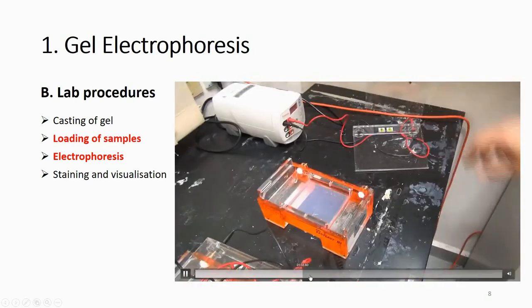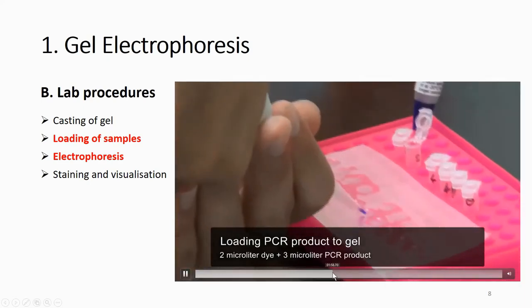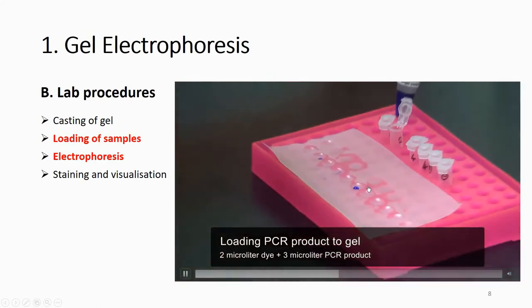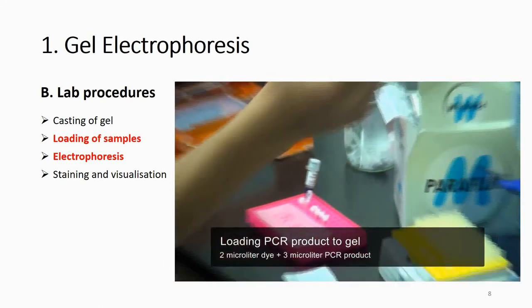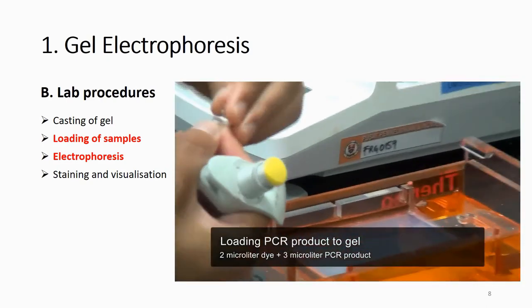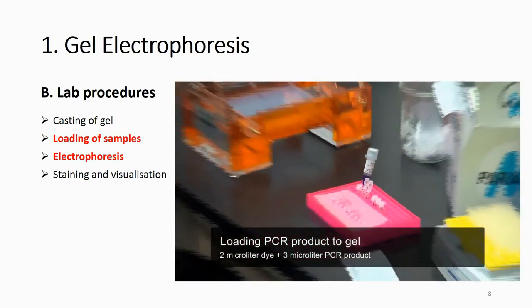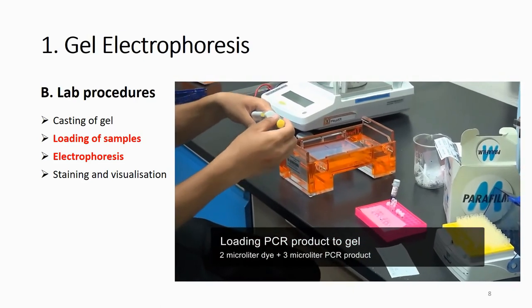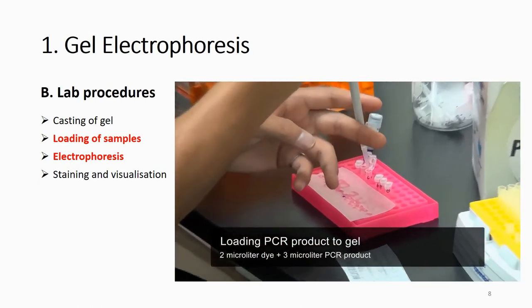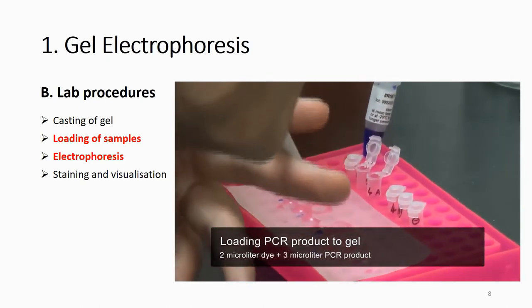If there is not enough buffer, just add more. The next step is to load the samples. You can see a colored solution — this is a loading dye mixed with your PCR product. Your PCR product has no color on its own, making it hard to see whether you loaded it correctly. The loading dye also lets you monitor how far your PCR product has migrated when you turn on the power supply.